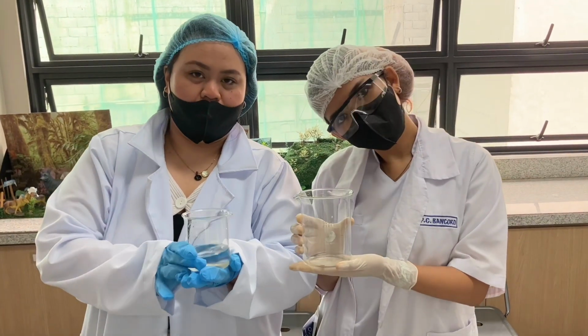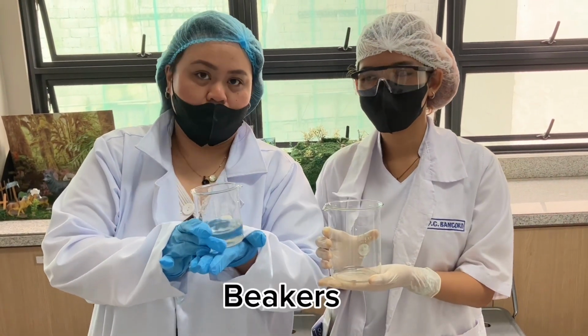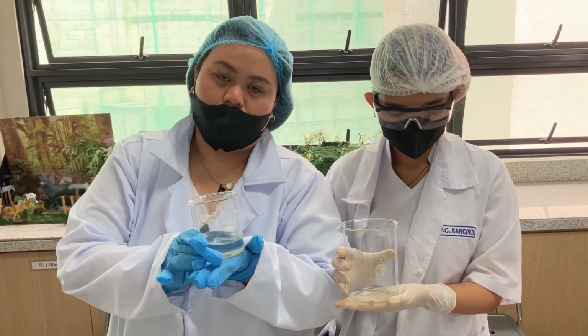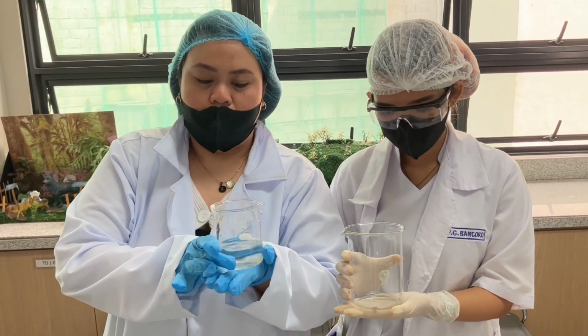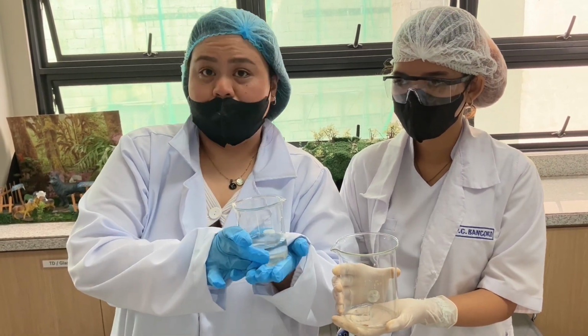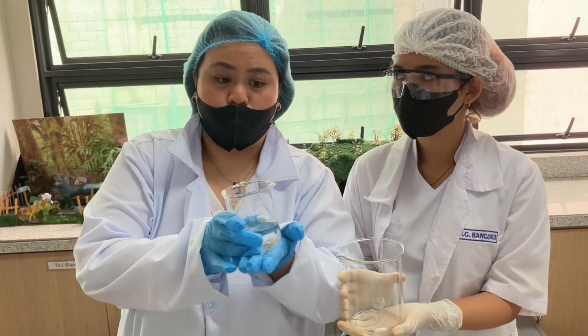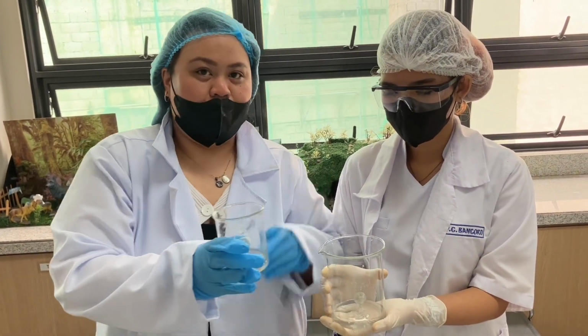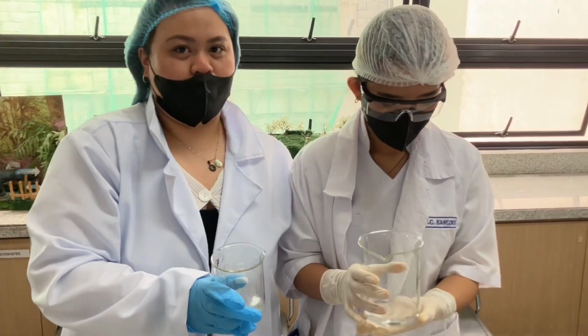Hello there, we have here the beakers. These beakers are glass containers which are used to hold liquid or solid samples. They have a lip opening which allows us to seamlessly transfer the sample from one container to another. My friend here will discuss the function of the beakers. So, ano nga ba yung function ng beakers?